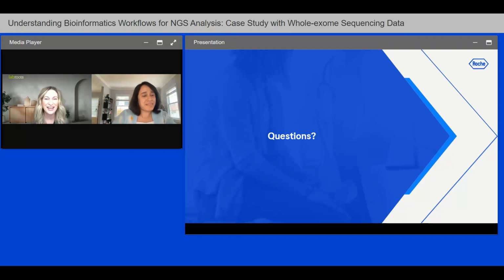Very good, thank you. Next question. Which of the analysis programs are free of charge? Actually, all of them are, because they are third-party online available tools. So they're available online free of charge.